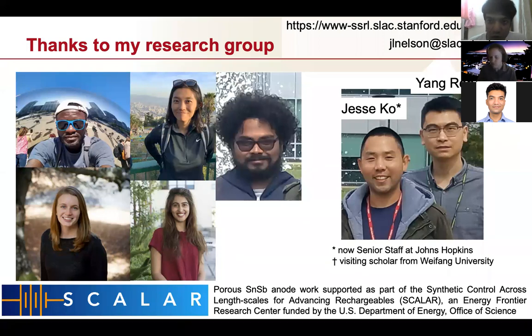Gustavo has a question. How do you ensure that you're tracking the same particle during charge and discharge cycles? Do you have to continuously see the particle or observe the particle during the operation?